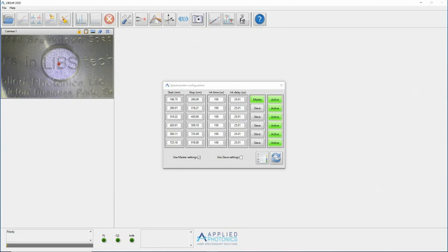An APL spectrometer module can contain from 1 to 8 Avantes spectrometer channels depending on the overall bandwidth of the module. The spectrometer configuration window shows the parameters for each channel separately. The spectrometer module used in this demonstration video contains 6 channels.